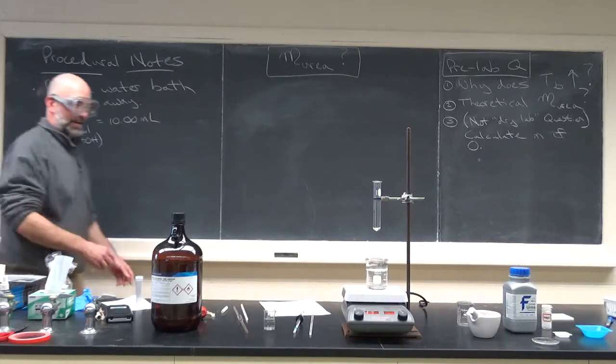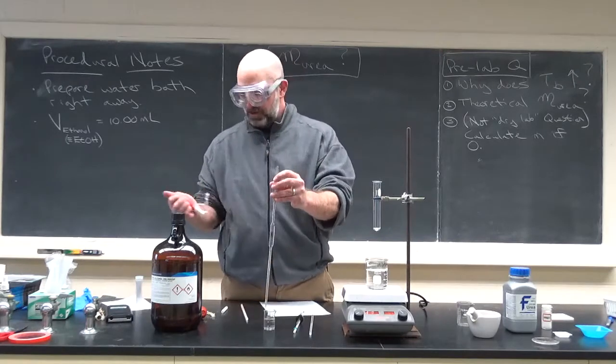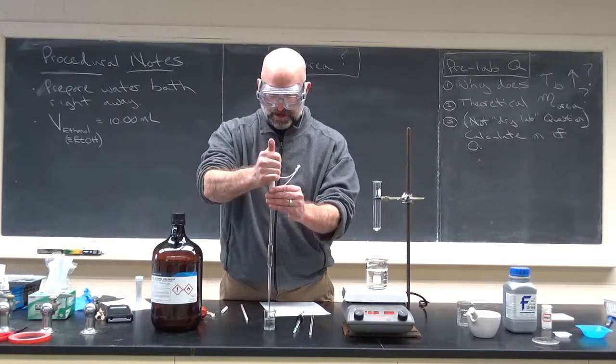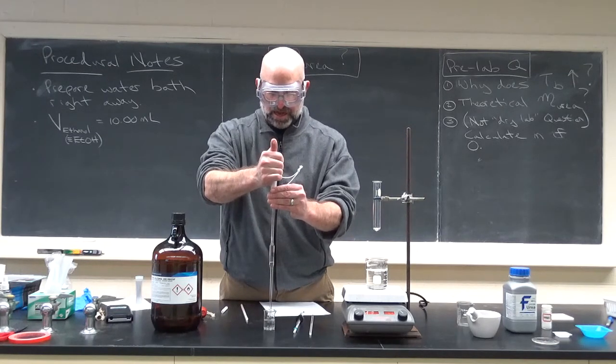So this is what's going to happen in lab. Your pipette might have a crack and you can't even tell. So again, press the bulb gently. There, that's much better. I don't know what you can see on the camera. And then you want to draw it up slowly. Don't let it shoot up when it gets into the smaller part.